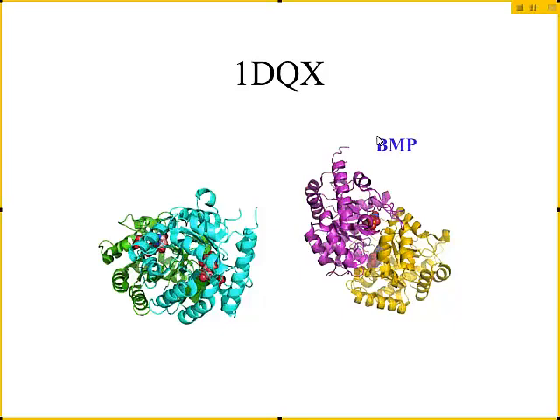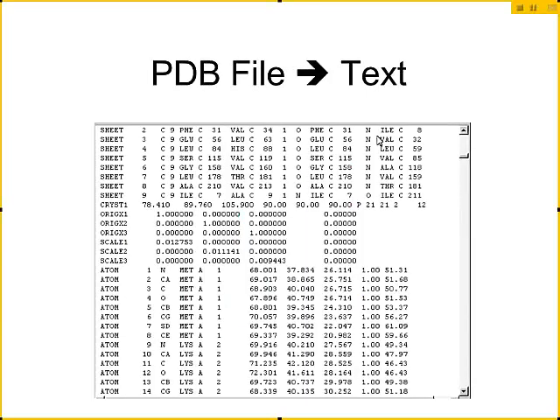If you actually go in and put up all the molecules in the crystal, you'll see that there's actually molecules making contacts all over the place that you're not seeing here. But the experimentalist has just picked 2 molecules which fulfill the symmetry, but they're working with whole molecules, and they just end up being far apart when they actually build the structure.